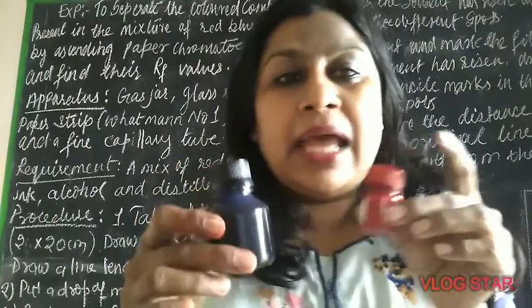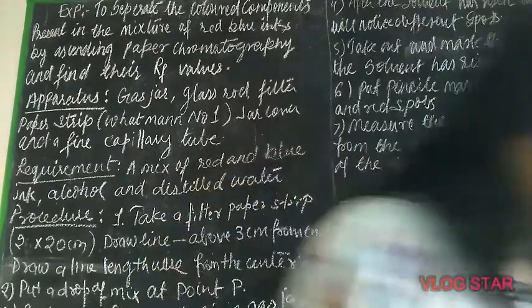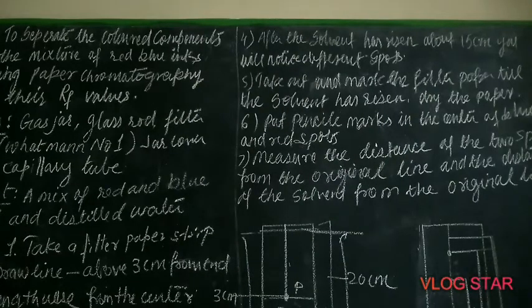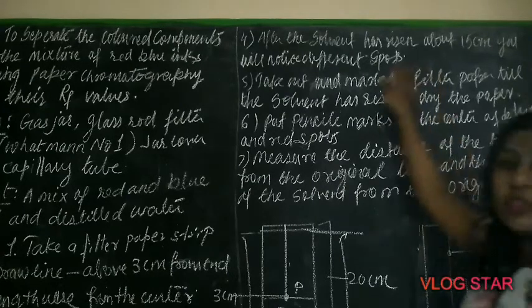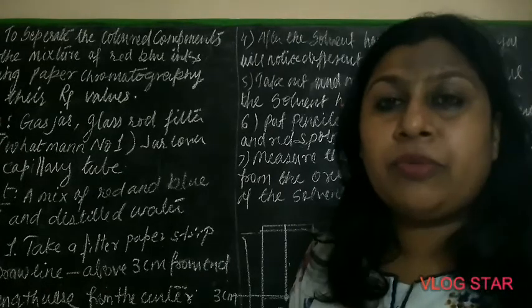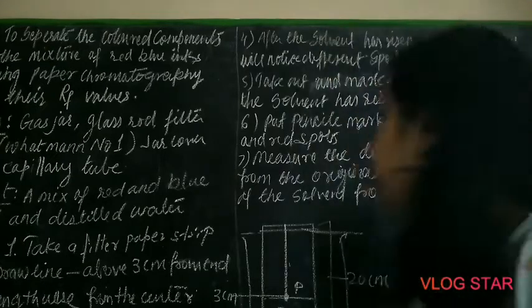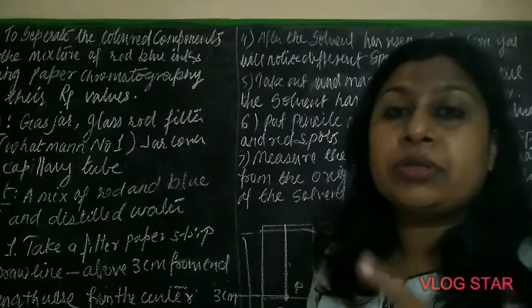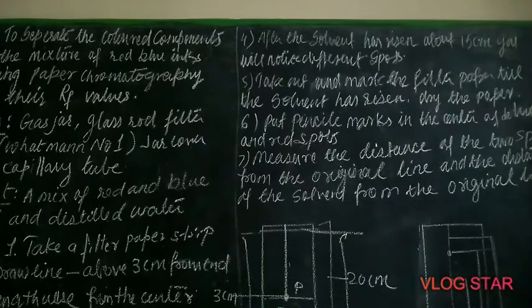So this is the blue and red ink I had taken. After the solvent has risen about 15 cm, you will notice different spots. You can have a calculated idea of when it reaches 15 cm, or you can mark 15 cm with a pencil — since the strip is 20 cm.